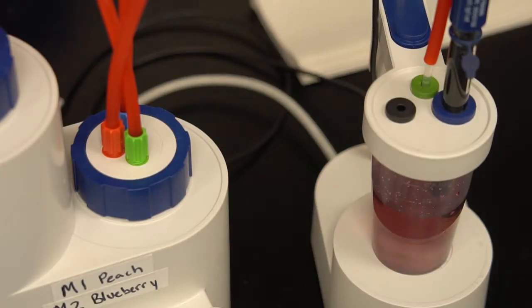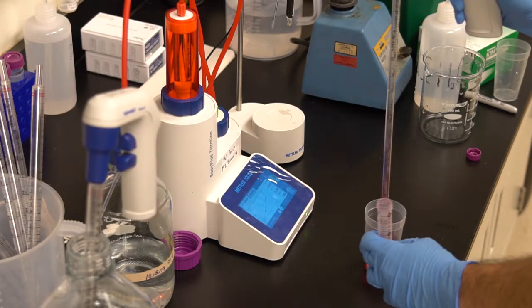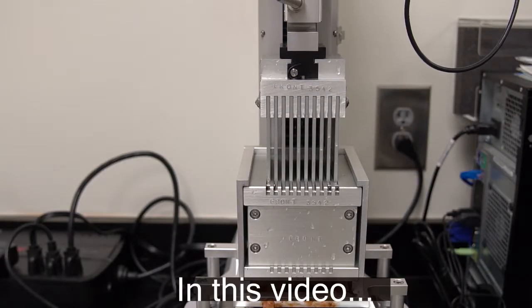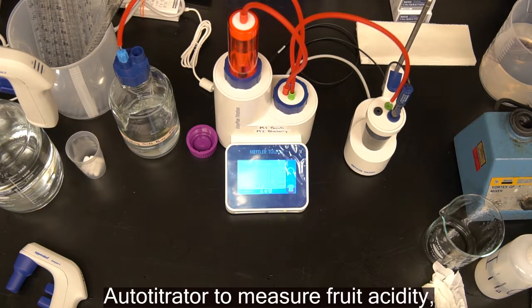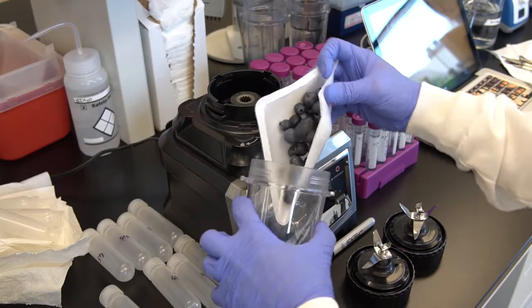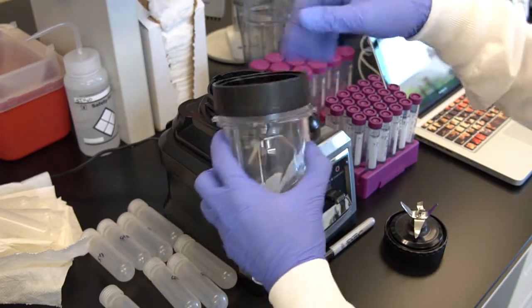These traits can be easily measured using simple lab instruments that are very common in fruit breeding programs. In this video, the instruments used to gather fruit quality phenotypes will be demonstrated. These include a texture analyzer to measure fruit firmness and skin toughness, Autotitrator to measure fruit acidity, and refractometer to measure soluble solids.